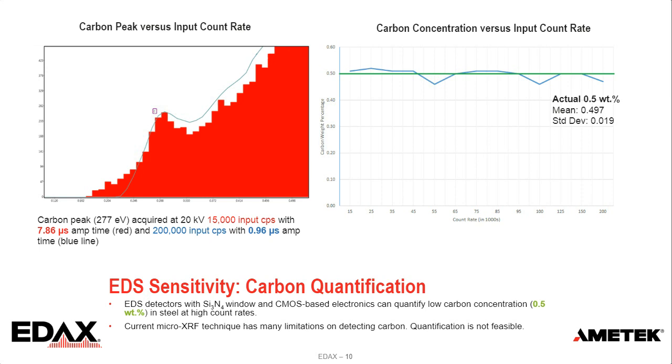On the Micro-XRF side, the current technique has many limitations on detecting carbon. Basically, carbon detection is not practical in Micro-XRF, and quantification of carbon is not feasible.